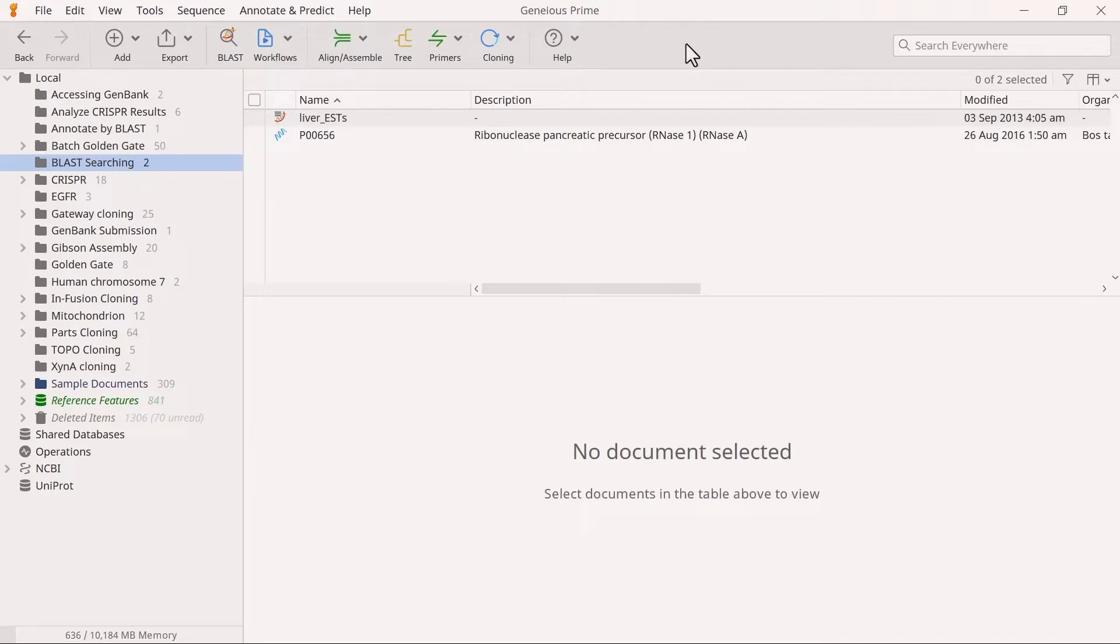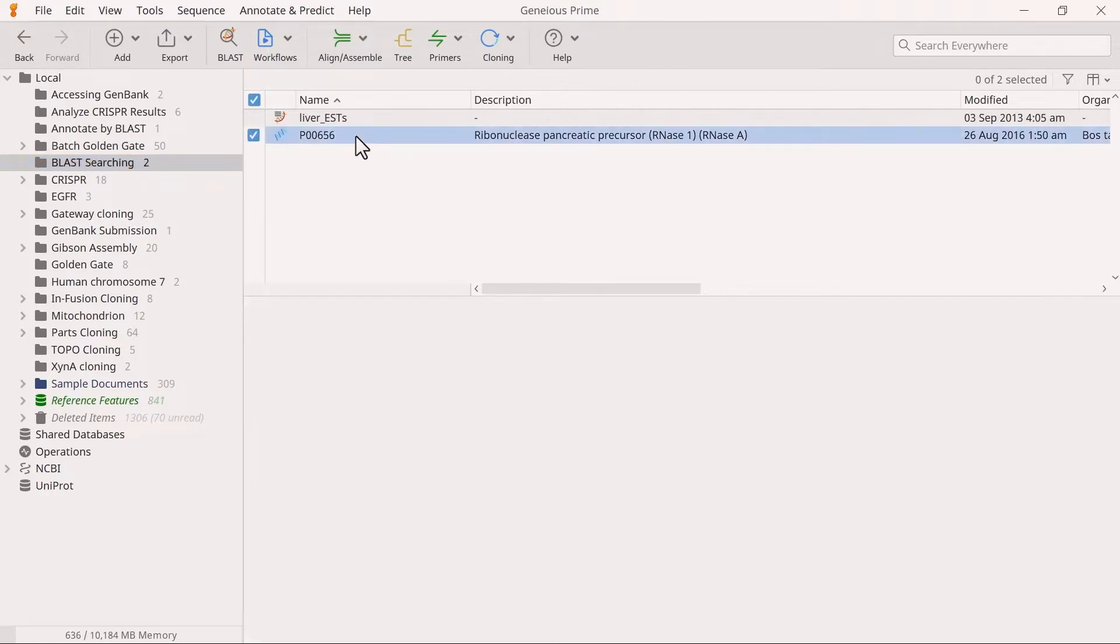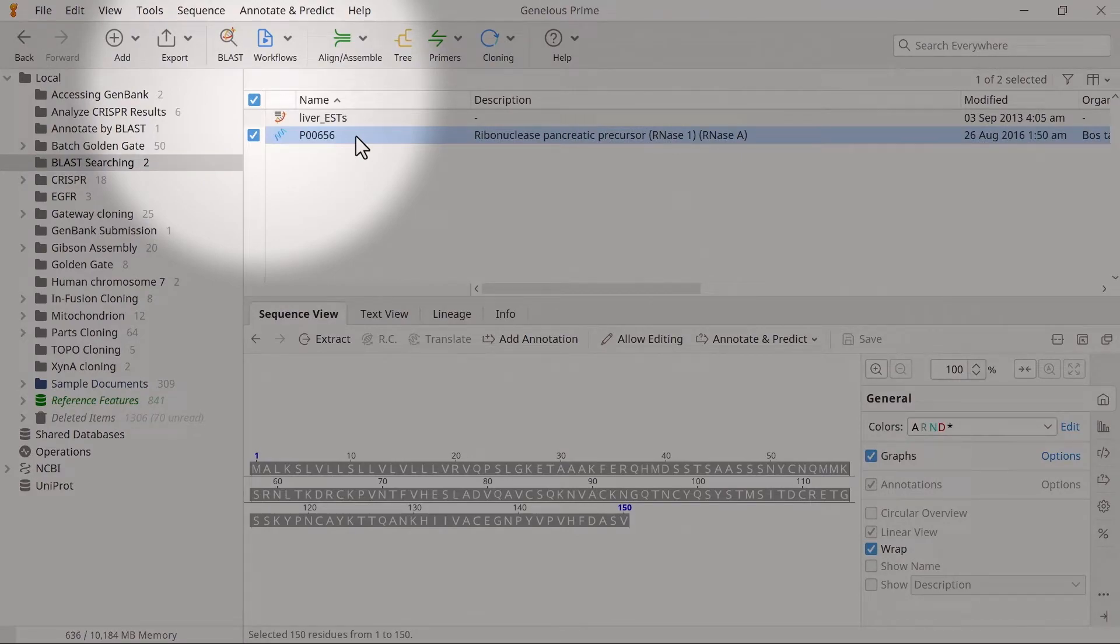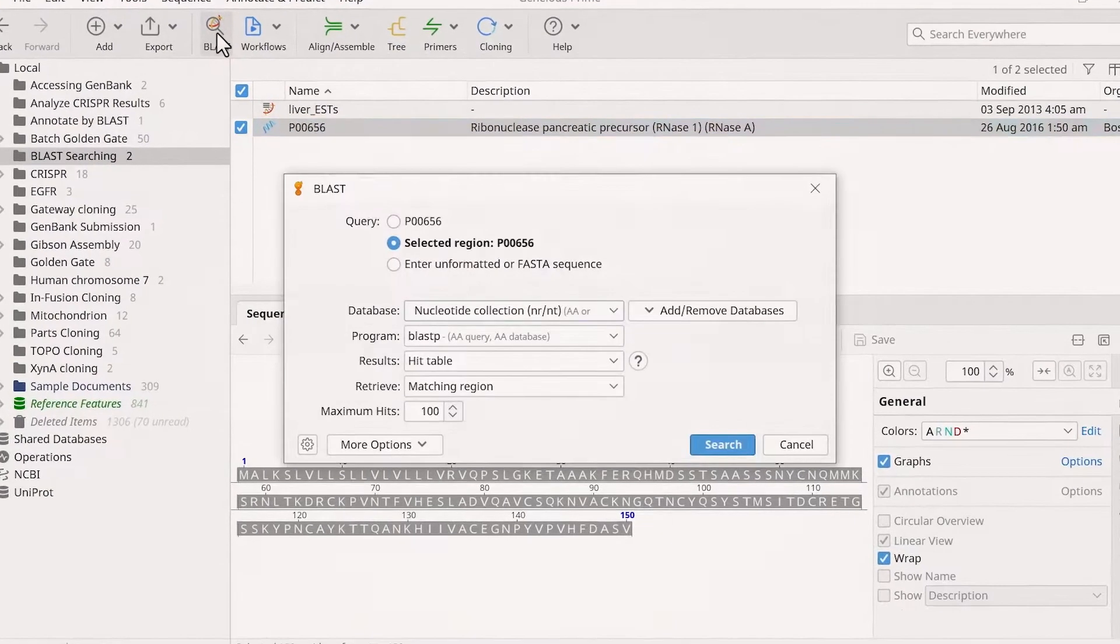To perform a BLAST search, select your nucleotide or protein sequence. For this example, we will use a protein sequence. Then, select the BLAST button.